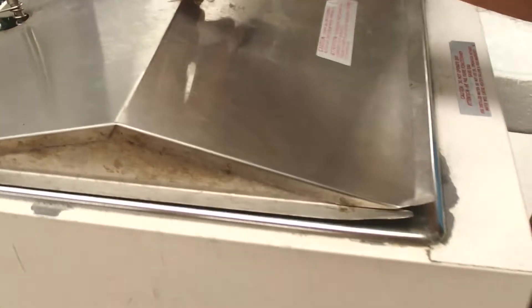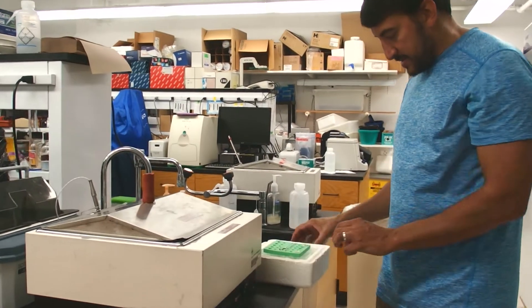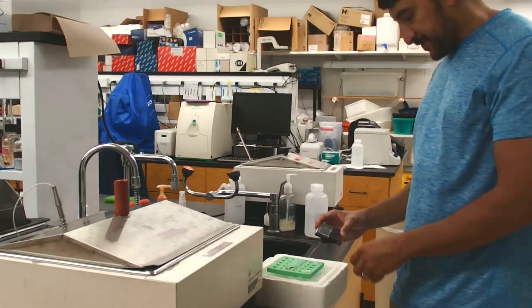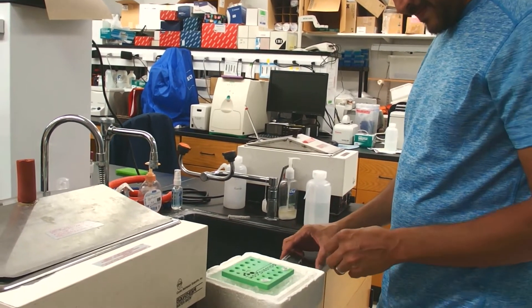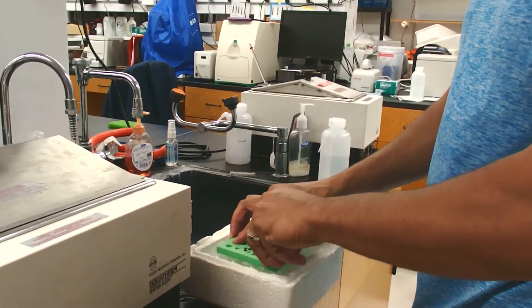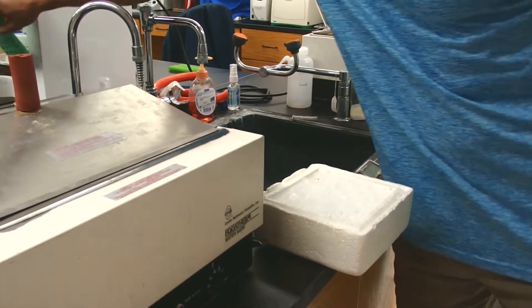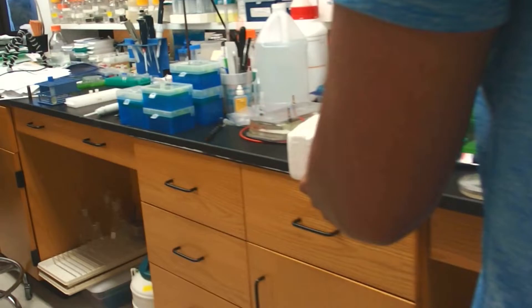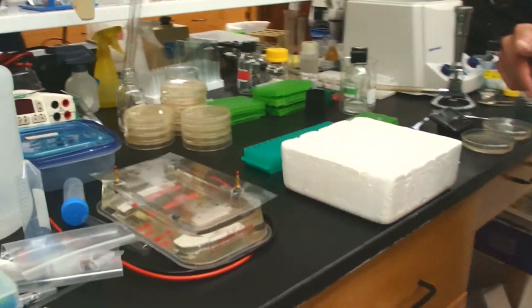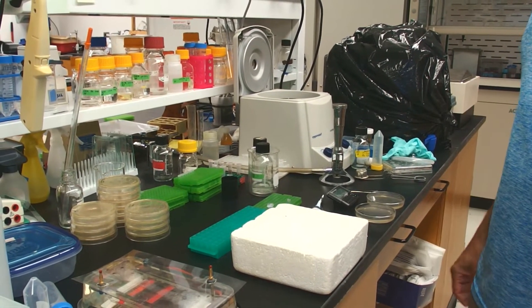They're floating in there. After 45 seconds, we get our competent cells out and put them directly on the ice. Then we'll start the timer for two minutes — they should be on ice for two minutes. The theory is that the heat shock opens up the membranes a little bit so that plasmids can get in, and the ice then seals up the membrane so the plasmid is trapped inside and the cells maintain their membrane integrity.